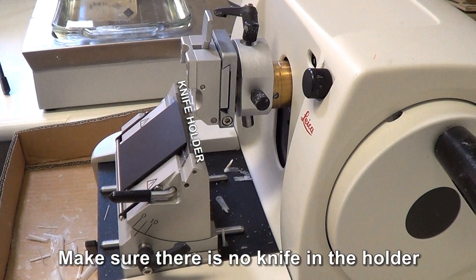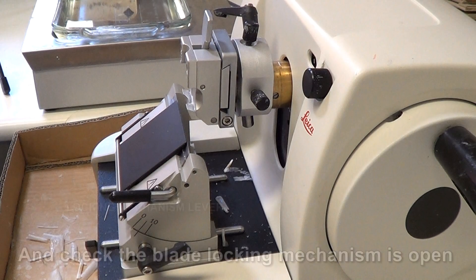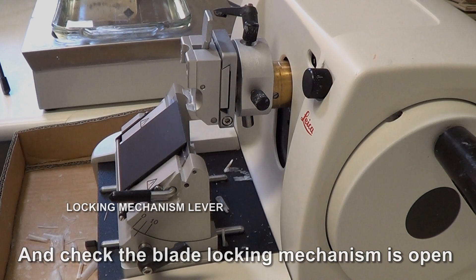Make sure there is no knife in the holder and the blade locking mechanism is open. When open, the lever is down.